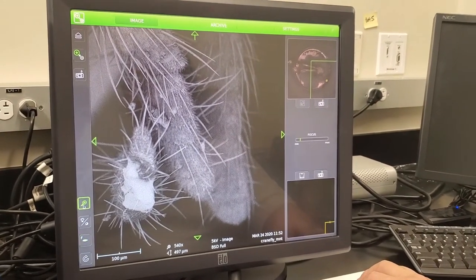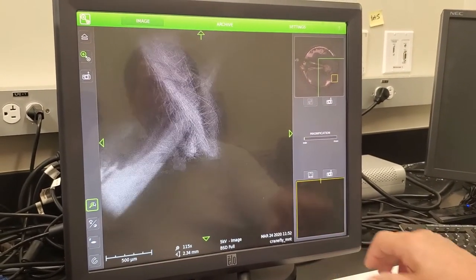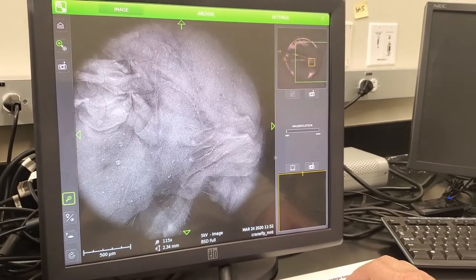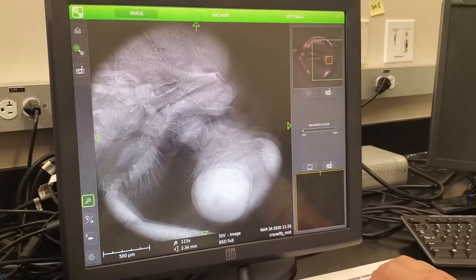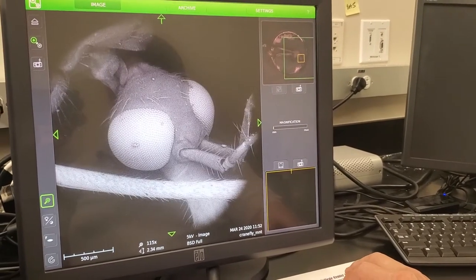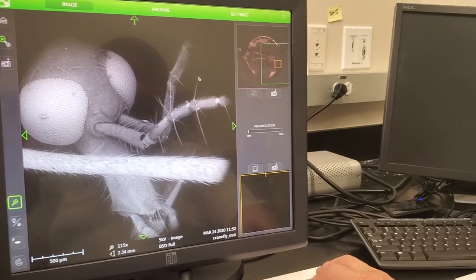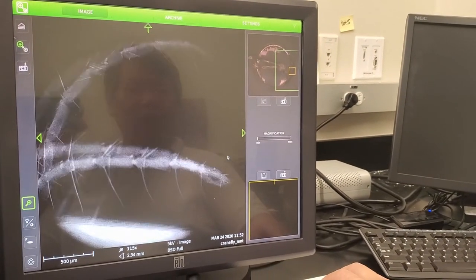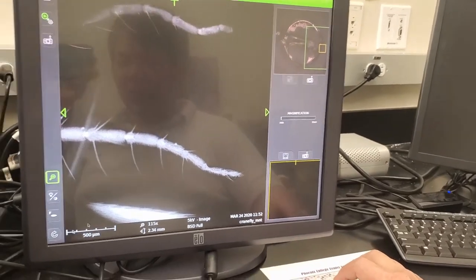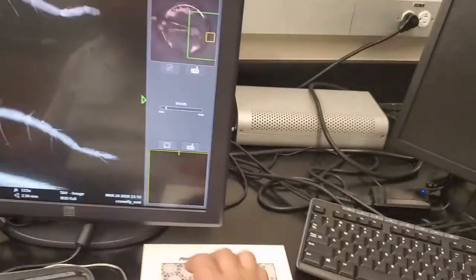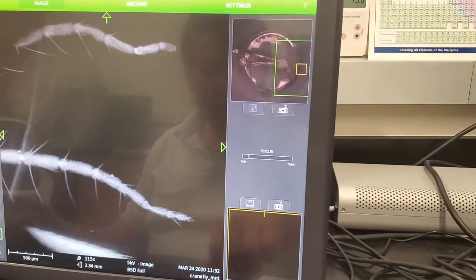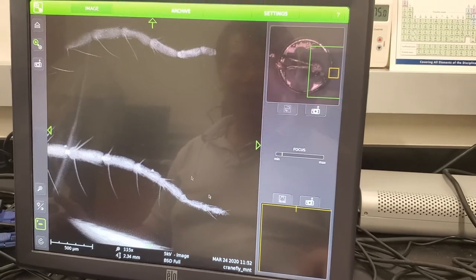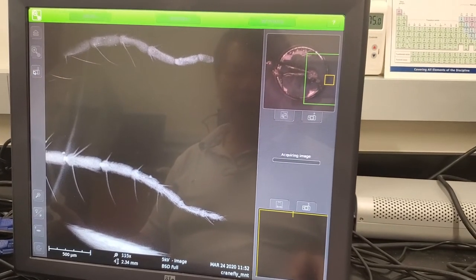Let's explore a little more and look at that guy's antenna. There are a couple of antennas right there. Pretty cool, huh? Let's see the tip of that thing. Let me focus on this — man, I wish you guys were with me. This would have been fun. So there's the antenna. I'm going to take a picture.